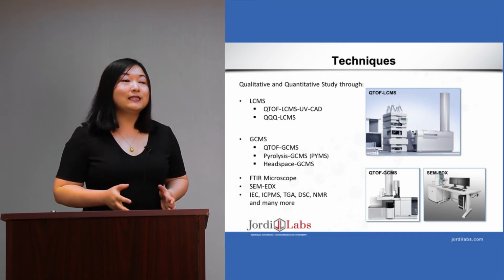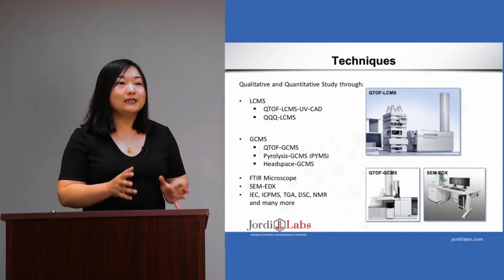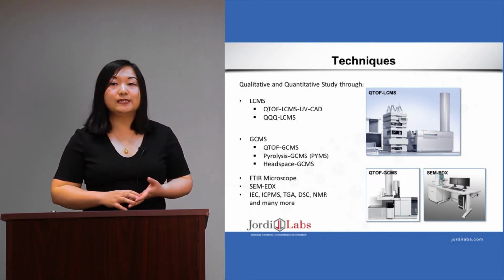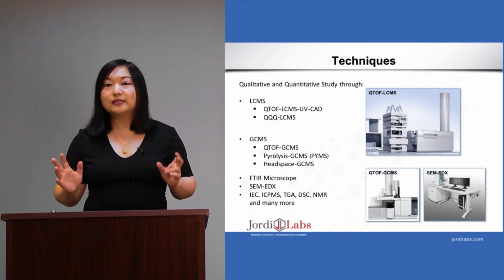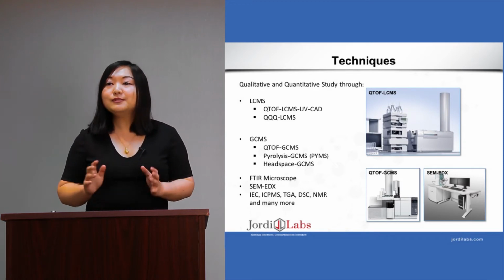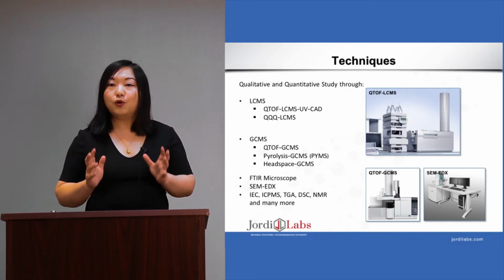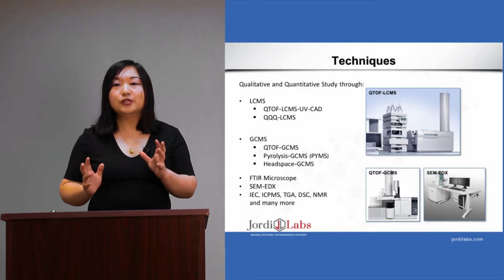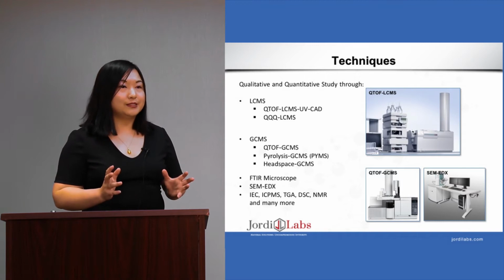Given the complexity of cosmetic products, we pick different techniques to tackle different types of compounds, which have different molecular weights, polarities, and volatility, etc. For example, LCMS is used to analyze compounds which are polar and ionizable, while GCMS is used to analyze the volatile and semi-volatile compounds.